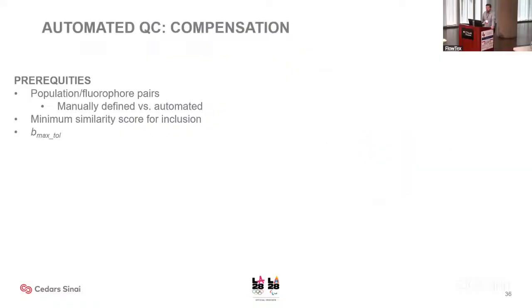What is the maximum slope that we're going to be allowing to be abnormal? Well, we're not going to get everything to 0. So do we say 1% off? Is that okay? 5%? Where do we want to cut that threshold? And I'll show that a little bit later. How do we actually adjust that slope? Do we adjust that slope all in one fell swoop for each marker?